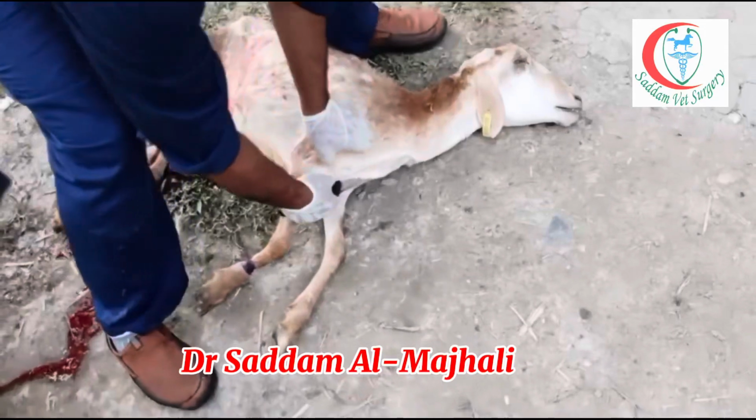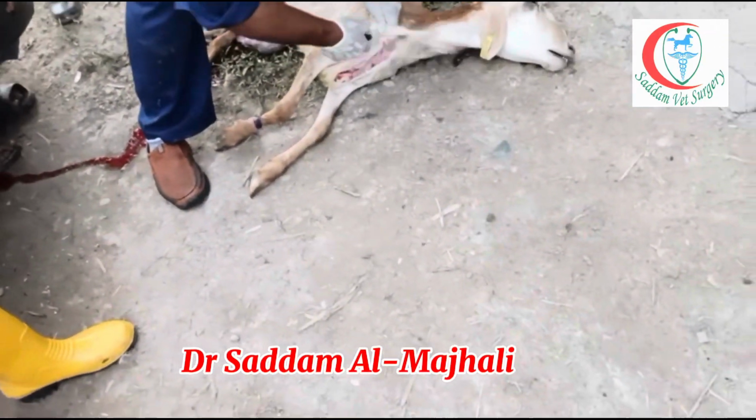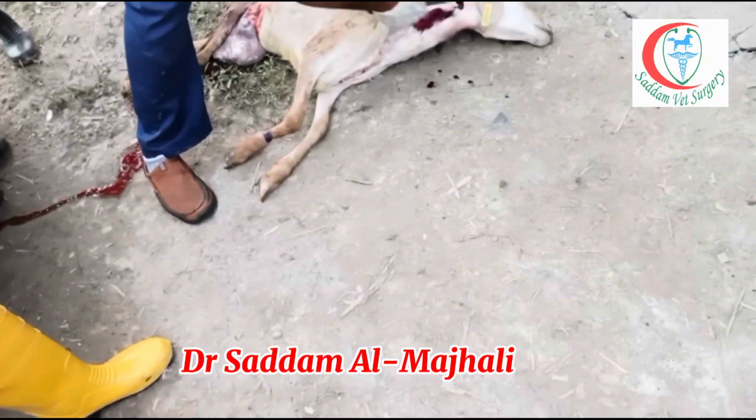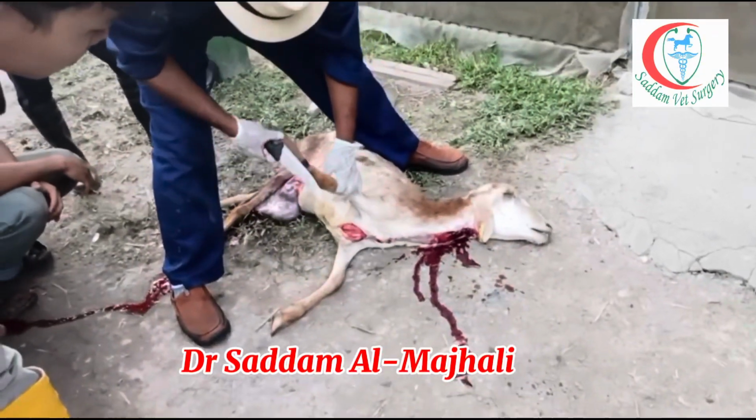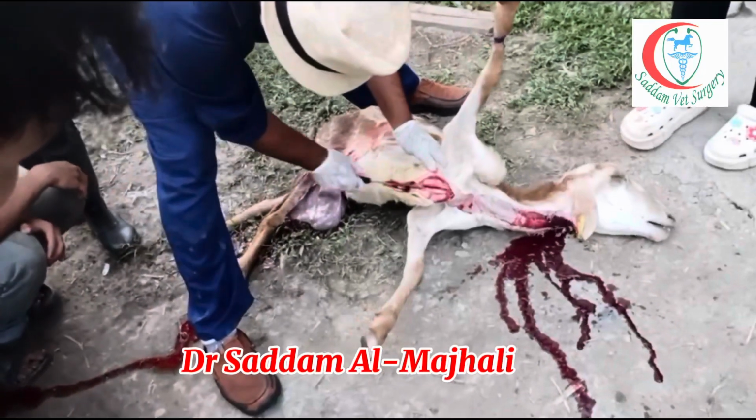All the skin I open until the root. After I open the skin, someone help, they catch this one. I remove the skin.